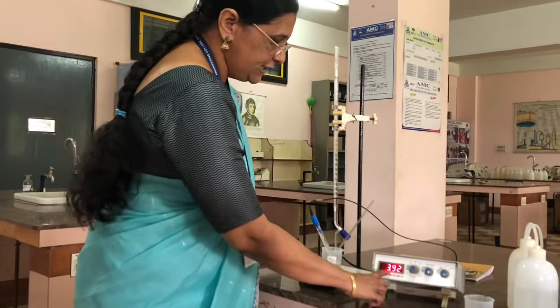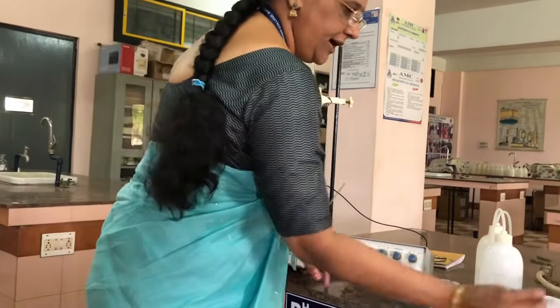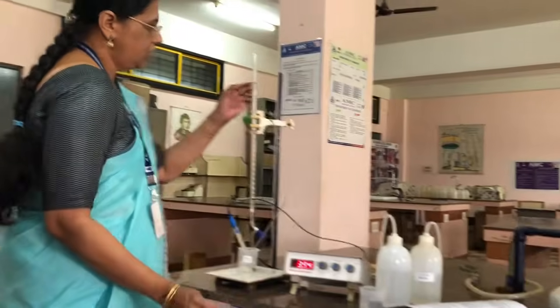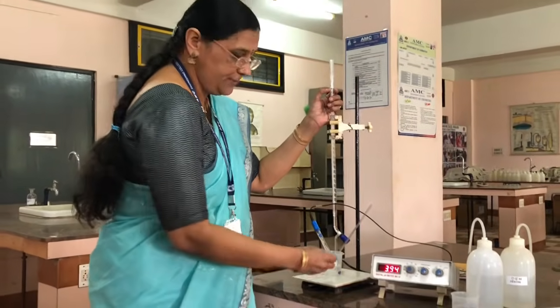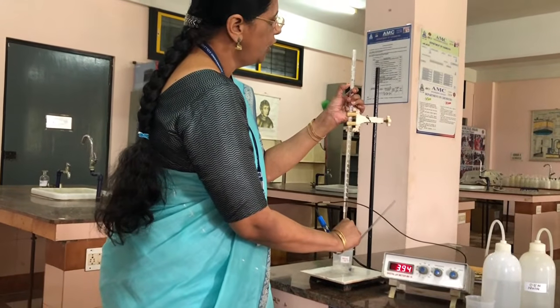Now with the addition of 0.5 ml of sodium hydroxide, the pH of the solution is 3.93. So we note down 3.93 with the addition of 0.5 ml of sodium hydroxide from the burette. Now again I am adding 0.5 ml, that means from 0.5 to 1 ml.